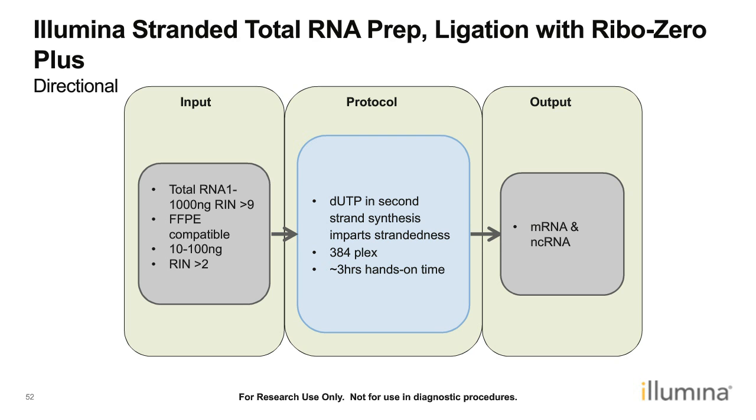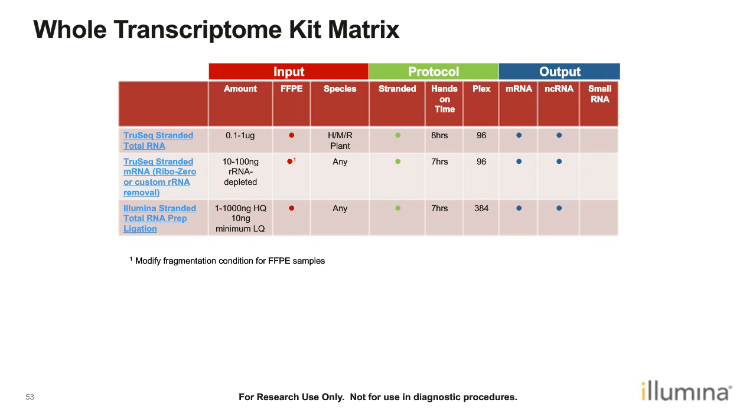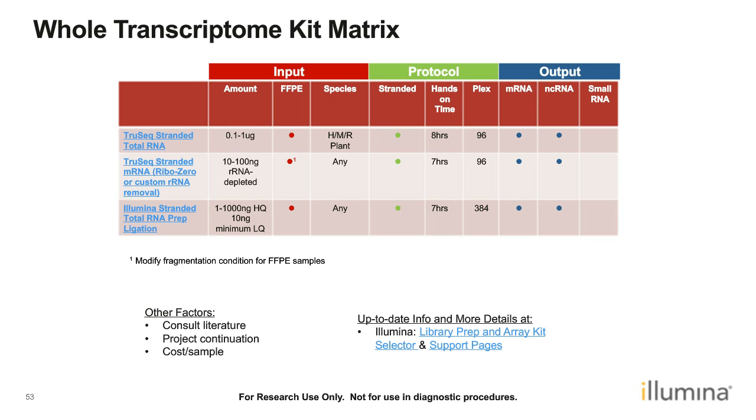And here we have our matrix again for our whole transcriptome kits. And as you may have noticed, the idea behind the kit is that you will rRNA deplete, then you will make your library. Once again, the literature, project continuation, and cost per sample should be considered.